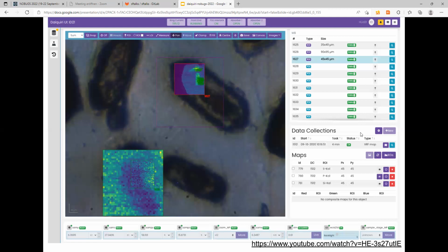They marked a new region, they did another data collection. So you can use it to go around and use bits. We have a series of standard panels at the top and off canvas as well. So we have state synchronous stuff, so you know whether you can actually collect data right now or not. At the bottom, we have standard motor monitoring. So you can see the status of motors, the state of the camera, the moving backlight, things like that.